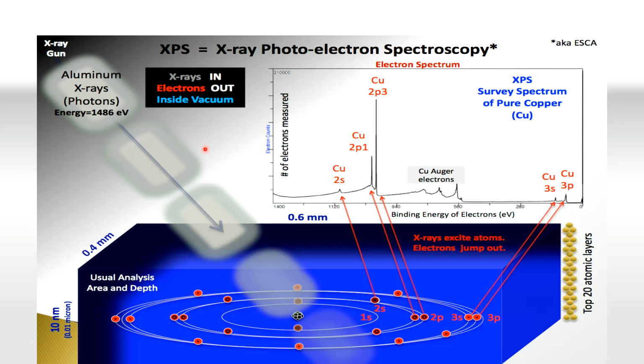First, I would like to give a brief explanation about the XPS. XPS works like this. The X-rays fall over the metal atom and the electrons get excited. The energy of the X-ray is higher than the binding energy of the electrons, and then the kinetic energy of the excited electrons gets measured, and we will have this kind of spectra.